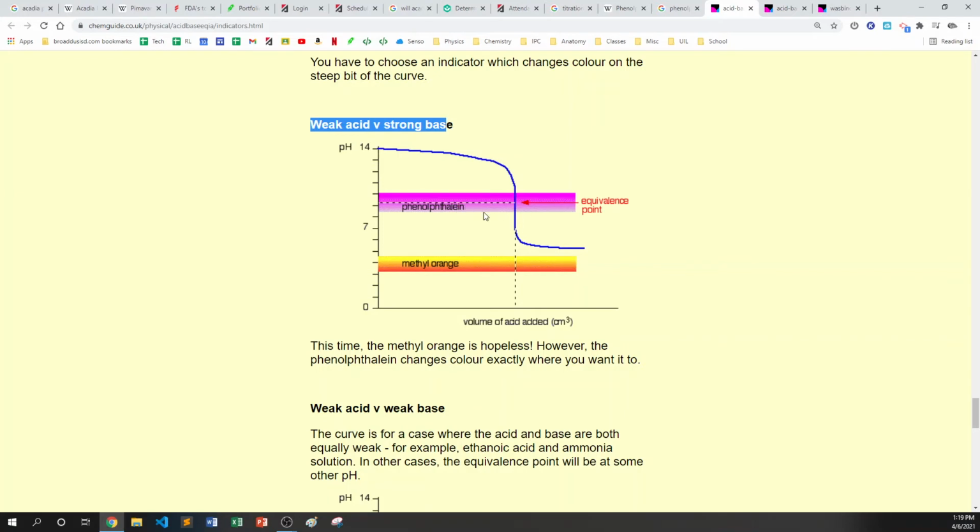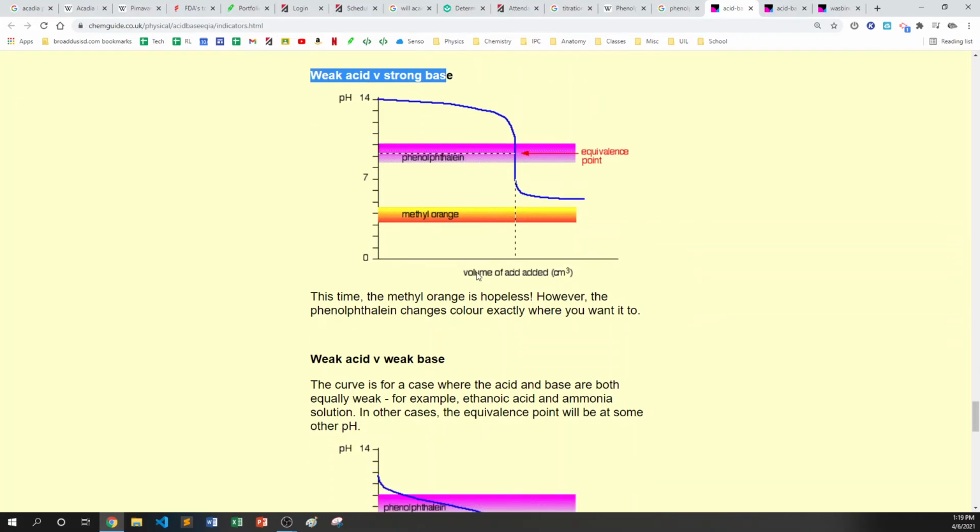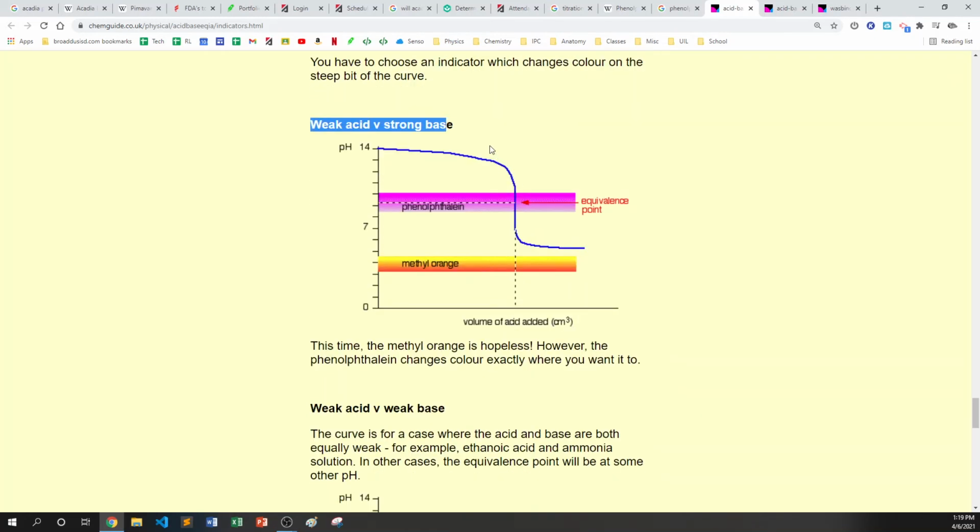Because I think phenolphthalein is slightly acidic too, and you have to account for that or something. I forget exactly what the difference between neutralization and equivalence point is. Right now, we're going to assume we can just magically know it's neutralized, in which case the pH will be 7. There is a difference, but basically you're trying to capture, and this volume can be ultra, like a speck of a speck of a speck of a drop, to get it to land right there. But if you know right here it's clear, you put a drop into it, it flashes pink, and then it's right over here, you can basically assume, guesstimating it, but you're not very precise.